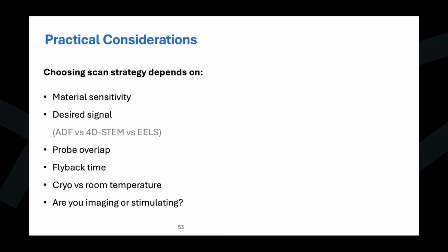So Mariana showed barium titanate, and that's again where we were just using a traditional side entry single tilt, in our case ELSA holder. So nothing fancy. And we really can see it helps using different scan patterns for ptychography. And we also show that ptychography in this case actually really helps. We didn't think it would, because a lot of the time when we collect that data set, it's much slower than STEM, but in fact you're getting much nicer data.